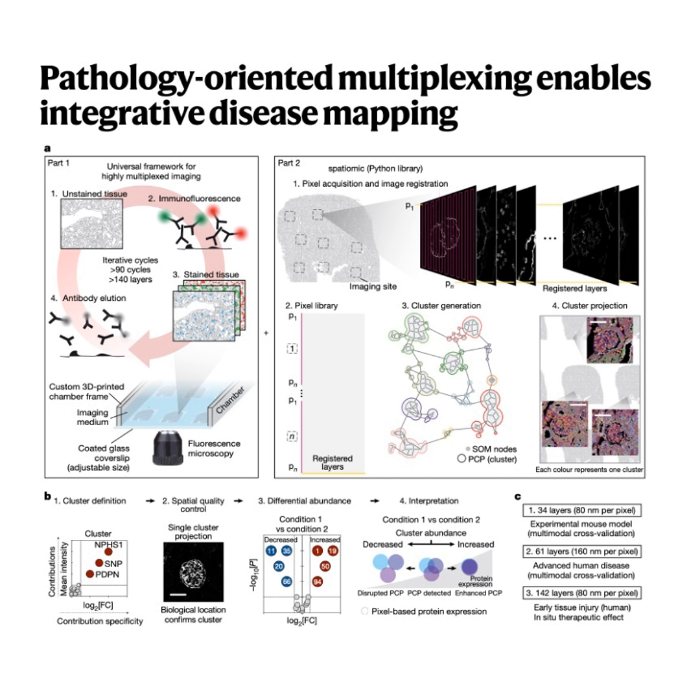Exactly. A cluster might capture, for instance, a signaling protein moving from the cytoplasm into the nucleus only in one corner of the cell, alongside other proteins involved in that pathway, right there. It integrates location, protein identity, and potentially activity state, like phosphorylation, into one signature. That's the cluster, a spatially precise, integrated biological state.